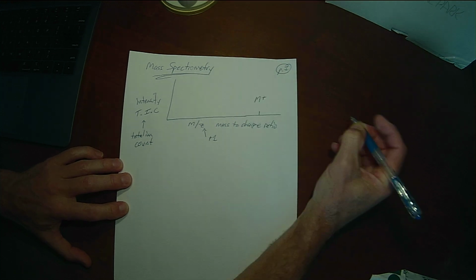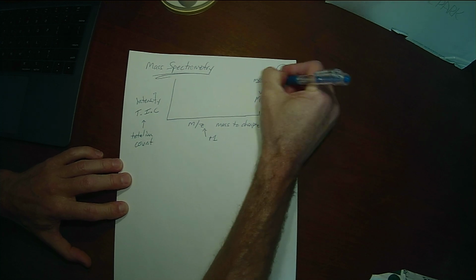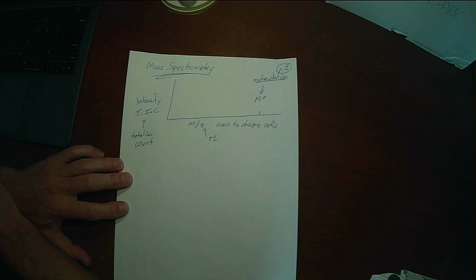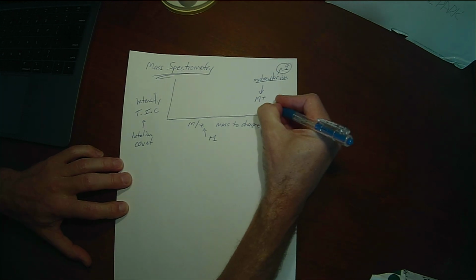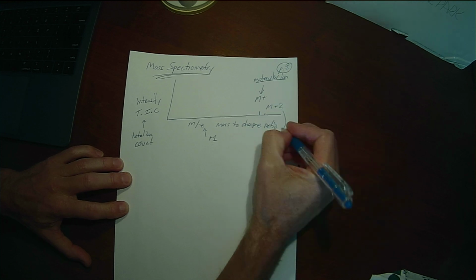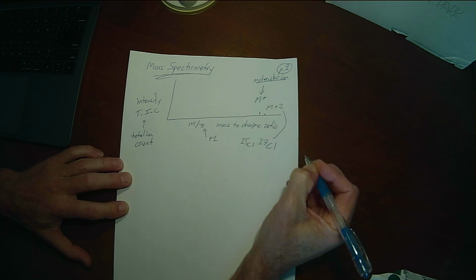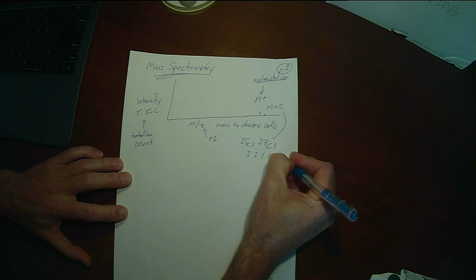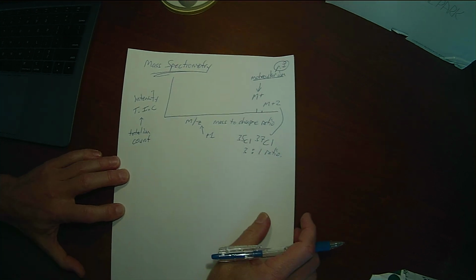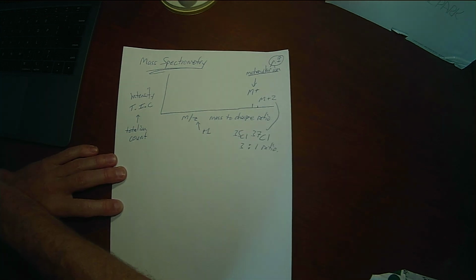M+, that capital M+, is what we call the molecular ion. That's the entire molecular weight of the substance. So it's just a molecule that had lost an electron and been converted into a positively charged species. And in these cases, because of the chlorine, we also have what we call an M+2 because of the other isotope of chlorine, right? 37 chlorine versus 35 chlorine. And we see that M+2 in about a 3-to-1 ratio because 37 chlorine is about a third the natural abundance of 35 chlorine. So we see an M and M+2. That's pretty distinctive for chlorine.